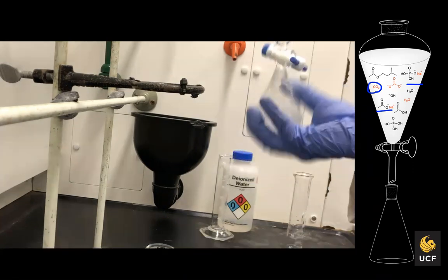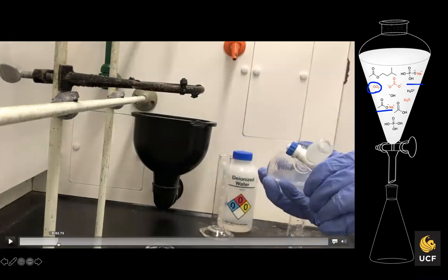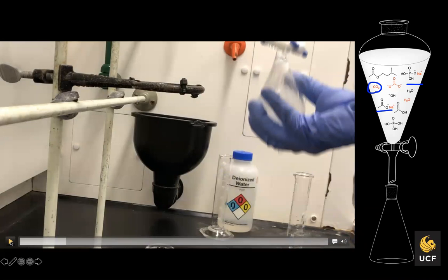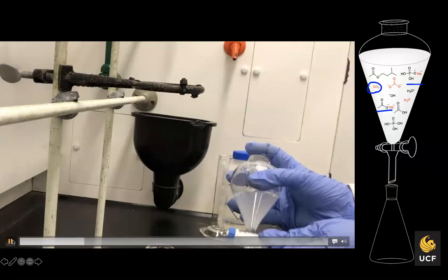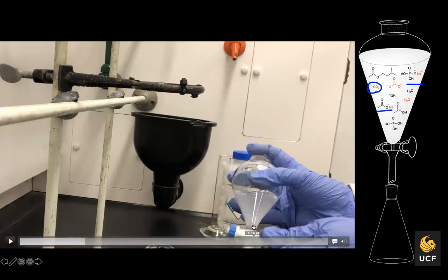So you'll notice that the carbon, oh, there it was. Okay, so the pressure buildup, and because of the way I was holding it and not venting it very quickly, some of what's in solution actually spilled off, and that's why the percent yield wasn't as close as it should have been. So it spilled off just because of the amount of carbon dioxide that was being evolved. So venting it very often is very crucial in this case.